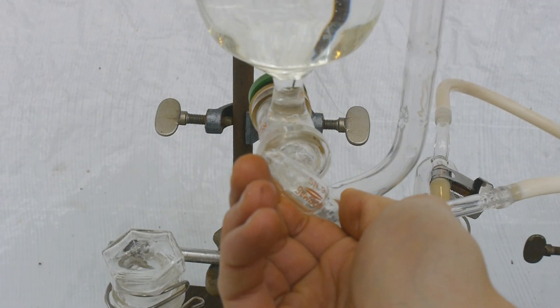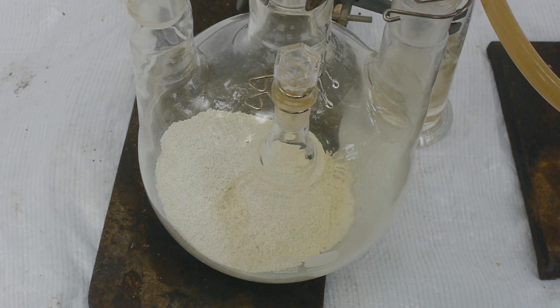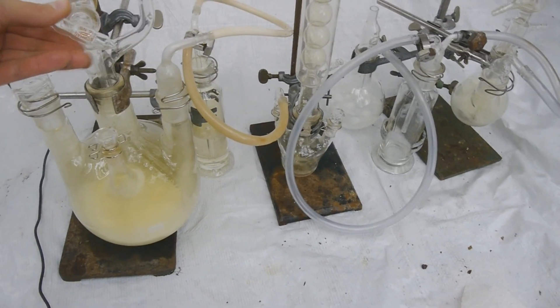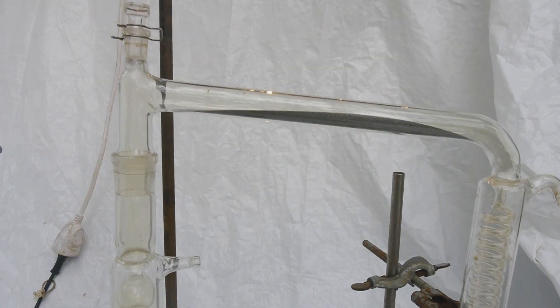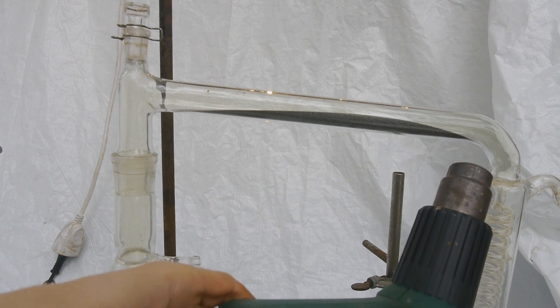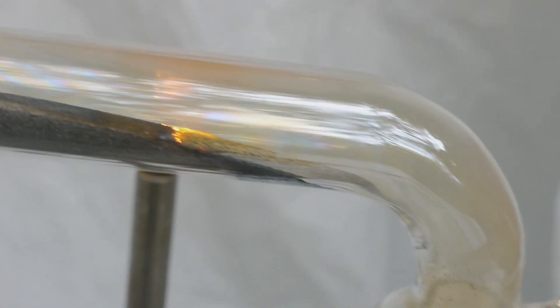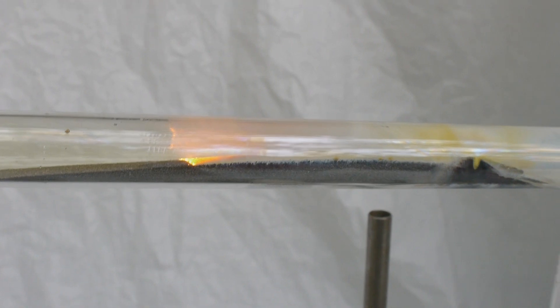Now let's slowly open the stopcock and let the hydrochloric acid drip — not flow — on the calcium hypochloride so we can start generating the chlorine. The entire apparatus is already flushed with chlorine; it's nice and green here in this tube. And now let's see if the heat gun is strong enough to start the reaction. This is looking great! This looks not healthy. I hope the glass can survive that — I have no idea, actually.